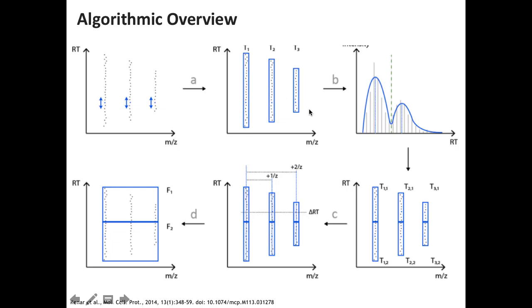And then we have the same issues that we see in proteomics as well. We can have a lack of baseline separation of these chromatographic peaks, in which case we need to cut the feature. We then cut these mass traces in half at that point. We need to make sure that we assemble the right mass traces.